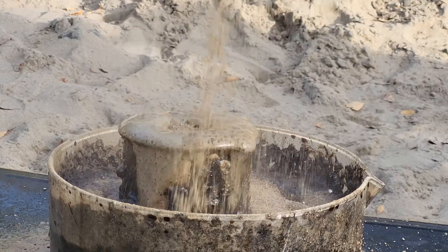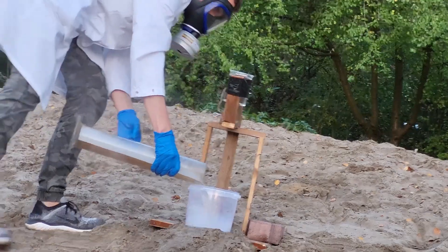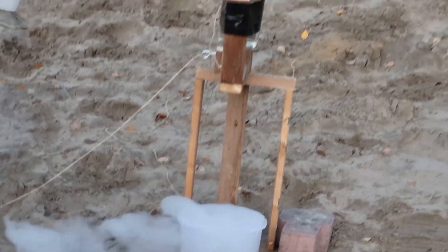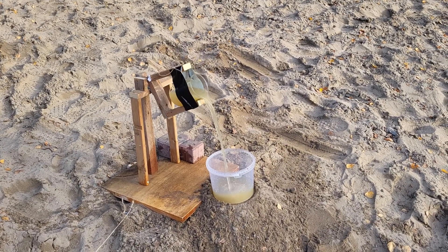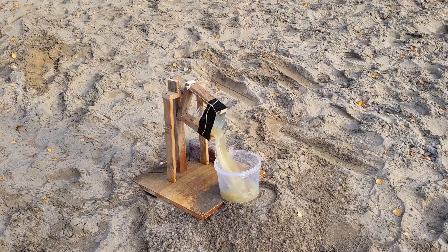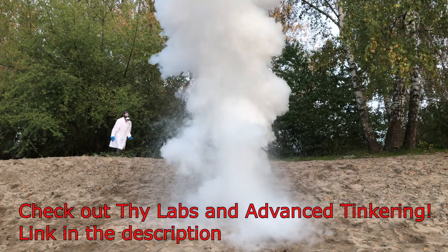In order to safely dispose of the acid in this brown sludge, we can just add powdered lime and water, which will neutralize it effectively. You learn in school that you should never pour water into acid — the obvious conclusion from this is that we pour some water into super acid. But I prefer not getting splashed by this hot acid that can eat your skin in seconds. That is why I want to thank Psylabs for building this construction for this video, and big thanks also goes to Advanced Tinkering. Thank you both so much for helping me perform these dangerous experiments.